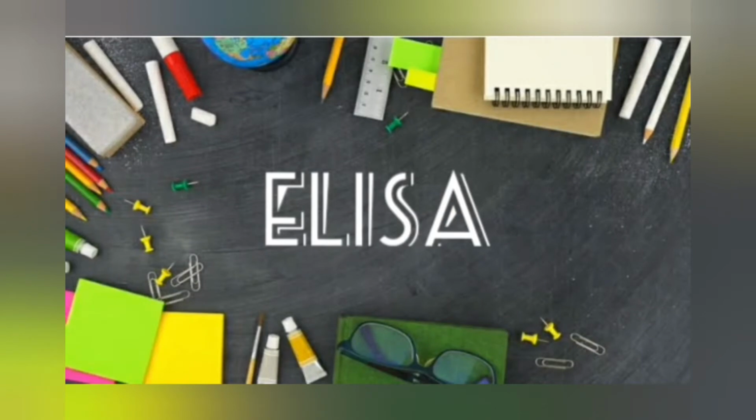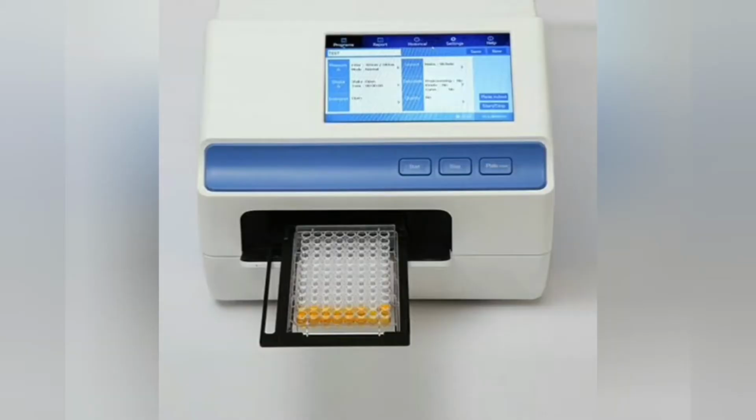Today we will talk about ELISA, its principle and different types of ELISA. ELISA is basically an antigen-antibody reaction and it stands for enzyme-linked immunosorbent assay. Actually, ELISA is a plate-based assay technique which is used for detecting and quantifying substances such as peptides, antibodies, hormones, etc. A number of enzymes have been used for ELISA such as alkaline phosphatase, horseradish peroxidase, and beta-galactosidase.